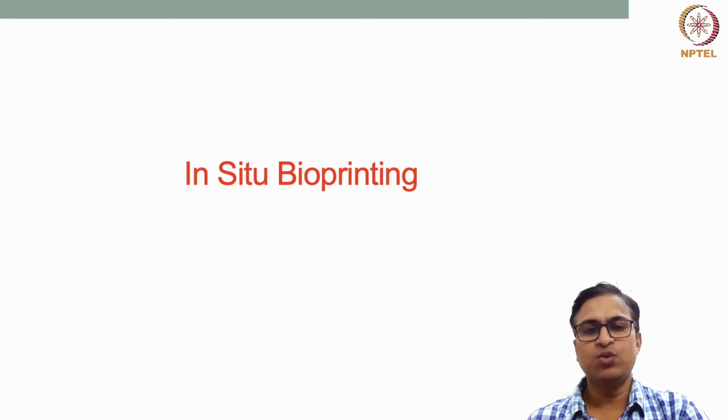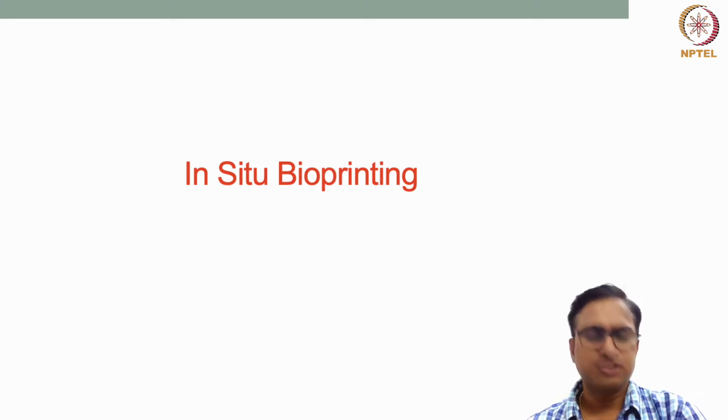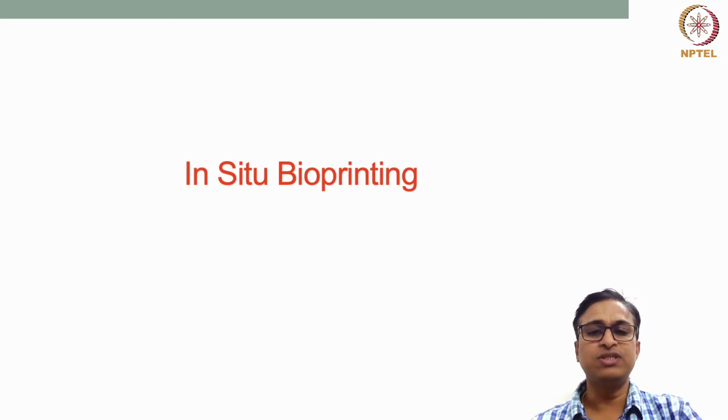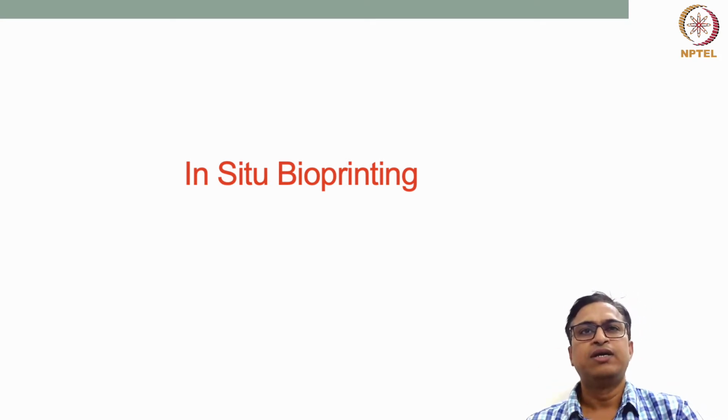In this lecture, we'll discuss a very important bioprinting concept that has been developed in the last few years. It is in situ bioprinting. Here, in situ means on the bed, on the patient. So this bioprinting deals with directly printing cells plus materials on the patient's wound bed directly.